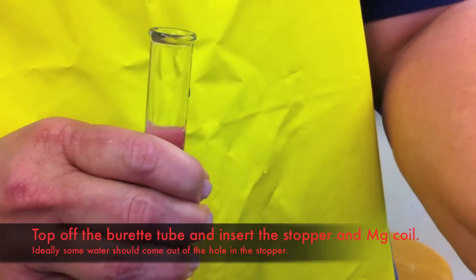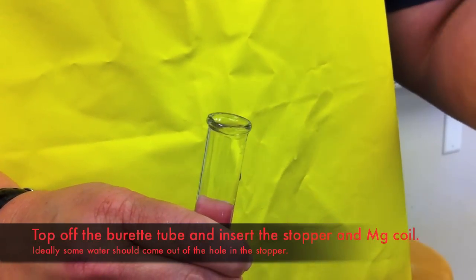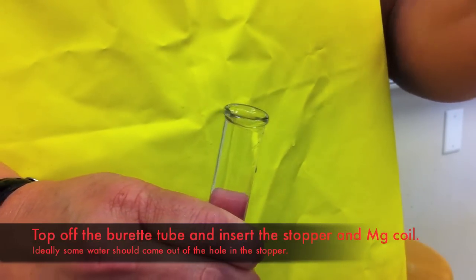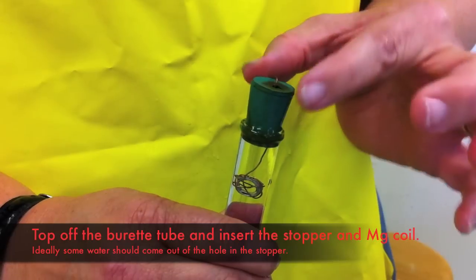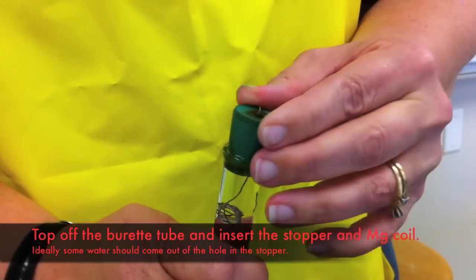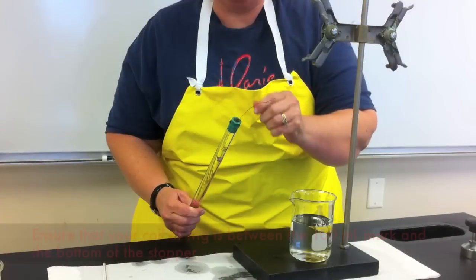When you put in the stopper, some of the water should go through the hole in the stopper, indicating that there is no air left in the burette. Before inserting the stopper, thread the copper wire with the magnesium ribbon through the hole in the stopper.